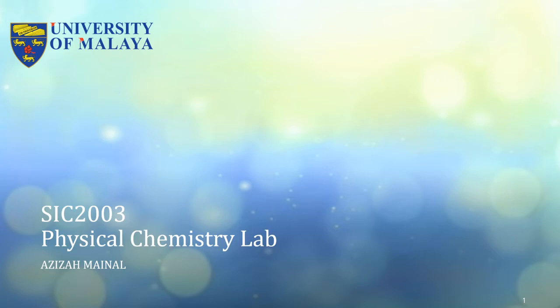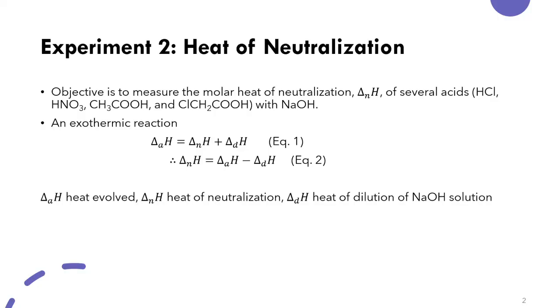Hi class, welcome back to SIC2003 Physical Chemistry Lab. Today we are going to discuss experiment 2, which is heat of neutralization. Now this is not something unfamiliar. You know what neutralization is. The heat of neutralization involves when one equivalent of an acid and one equivalent of base undergo a neutralization reaction to form water and salt.